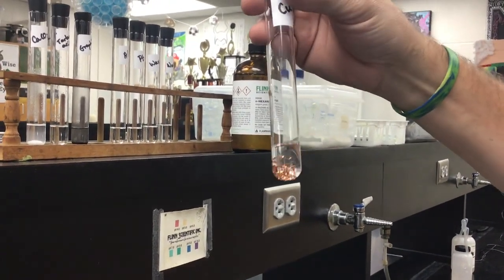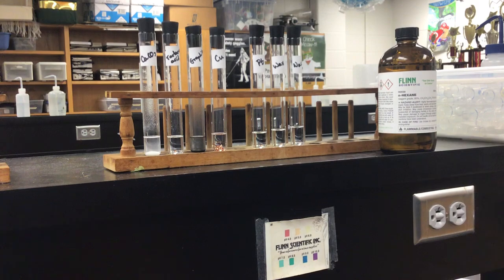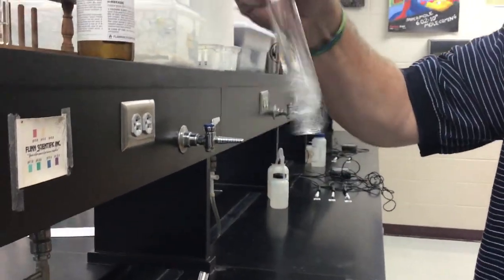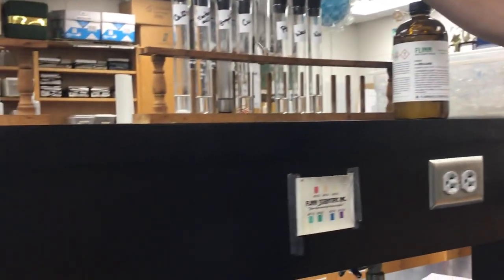She looks pretty. Okay. And we'll try the aluminum. So aluminum in the hexane. Kind of see on the bottom there. We'll come back and look at it again. So there's aluminum. We'll do lead as well.